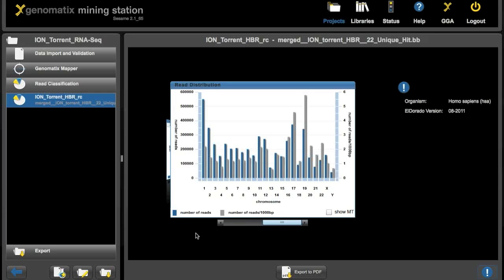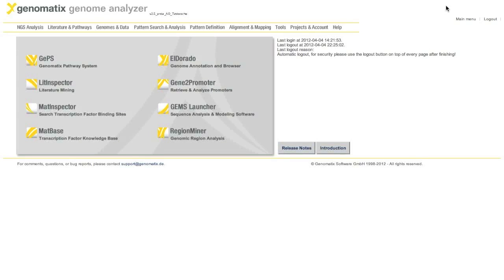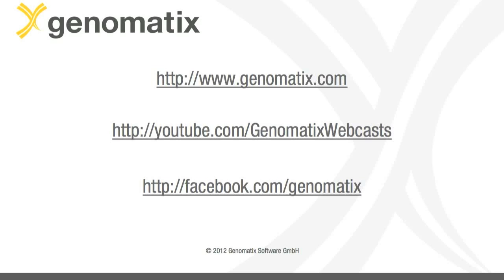We could go to downstream analysis now by clicking on the GGA button up here, but this will be shown in another movie. For more information on our solutions and services, please visit our web page at genomatix.com. More movies can be found on the GenomatixWebcasts channel on YouTube, and our Facebook page is at facebook.com slash genomatix. Thanks.